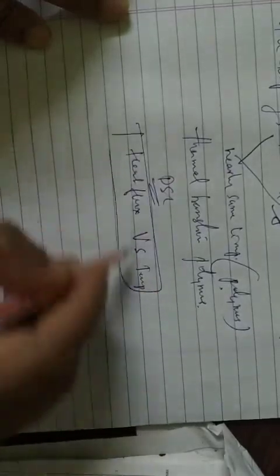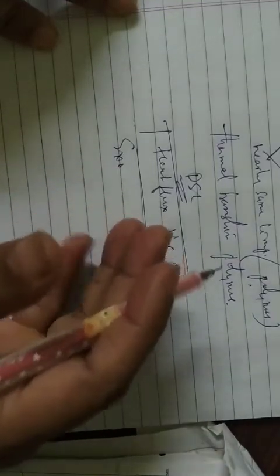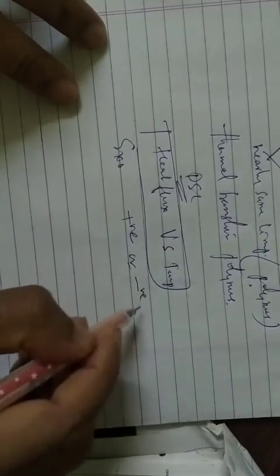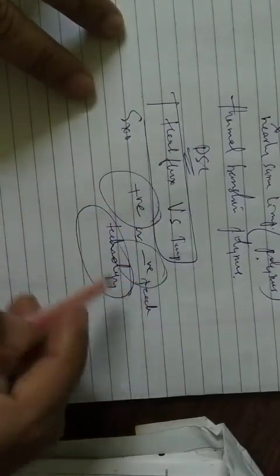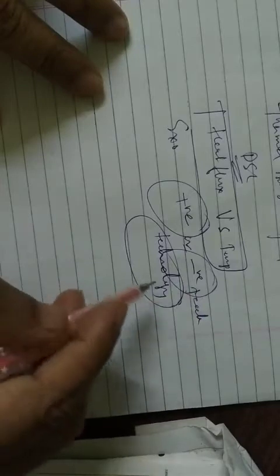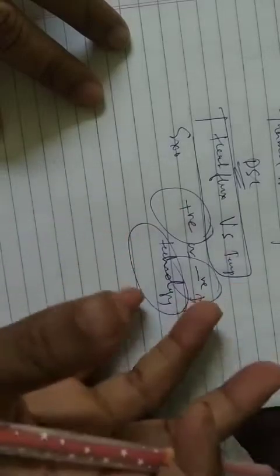There are two different conventions: for an exothermic reaction, where the sample releases heat, the peak may be positive or negative depending on the technology we use.